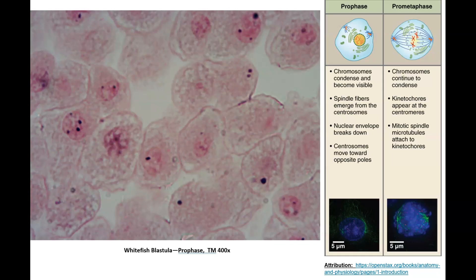Now we've moved out of interphase and we're going to look for prophase cells. Prophase is the first phase of mitosis. Some textbooks break it into prophase and prometaphase, or prophase and late prophase. One of the things happening here is the nuclear membrane is starting to dissolve or break down, so that duplicated chromosomes can easily migrate to the new poles of what will become two new cells. Spindle fibers start to form from the centrioles, acting like fishing line to connect to a kinetochore on the chromosomes and pull them to either side.